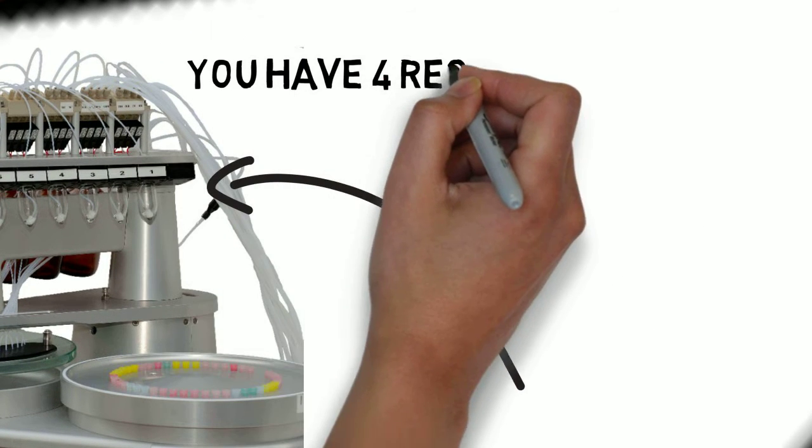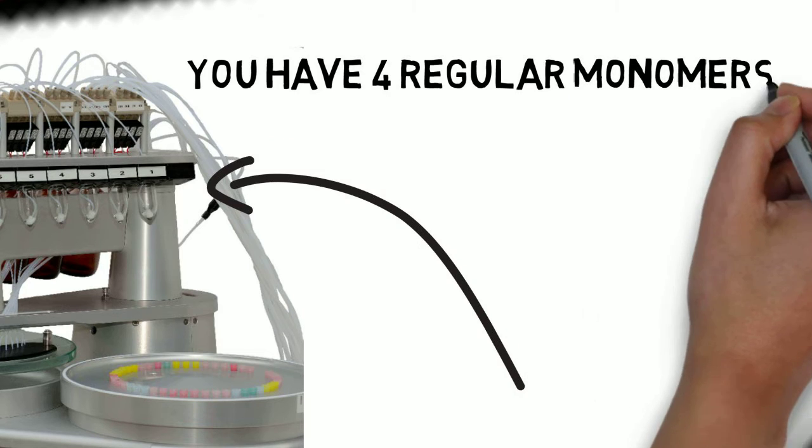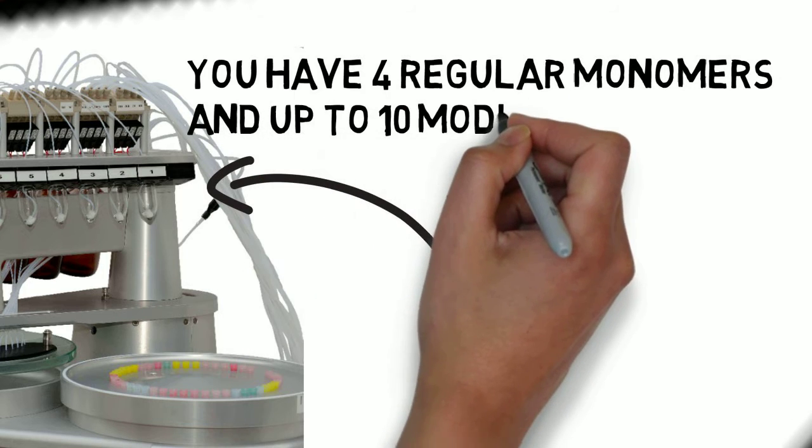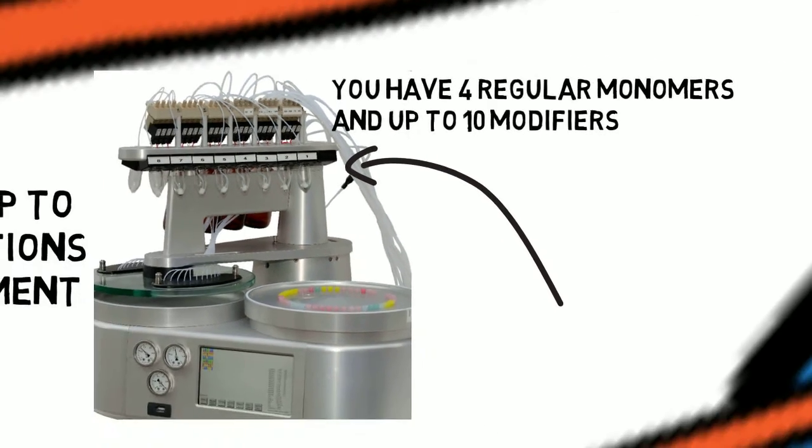We will have 4 regular monomers, as well as up to 10 modifiers. That should be enough for most people.